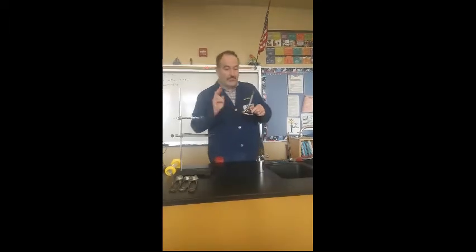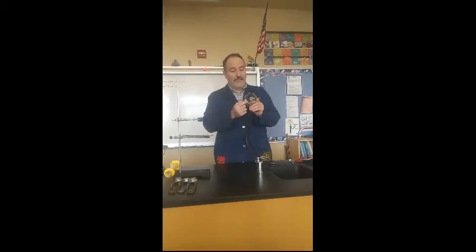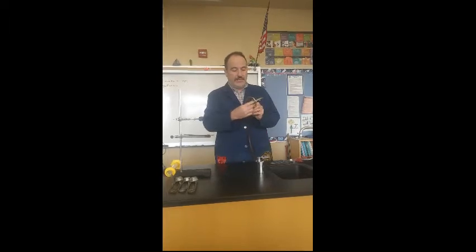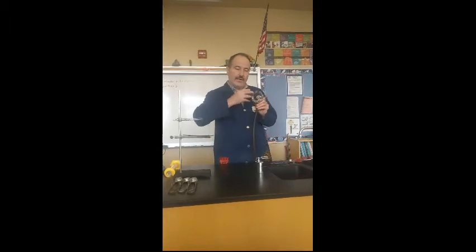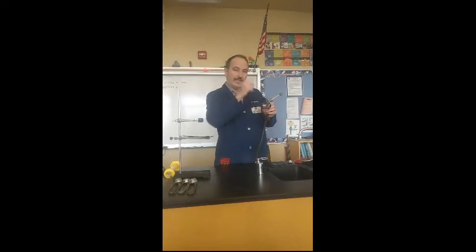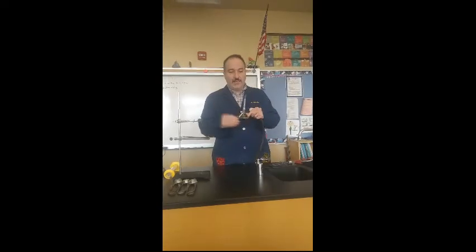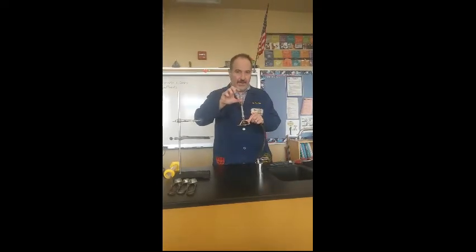Okay? Now, there's also two adjustments that you can make on here. You have on the very bottom, this is the gas adjustment valve. And basically, it works kind of like a faucet handle, okay? Where if you go to the right, it tightens it, and that kind of screws it up into the base. The tighter it is, the less gas comes in. The more open it is, the more gas that comes in. And what that basically does is that adjusts the height of the flame.